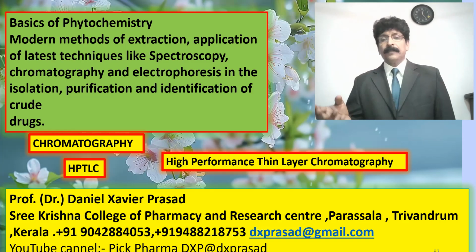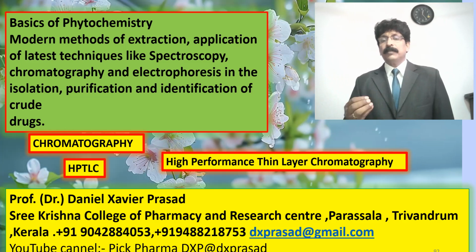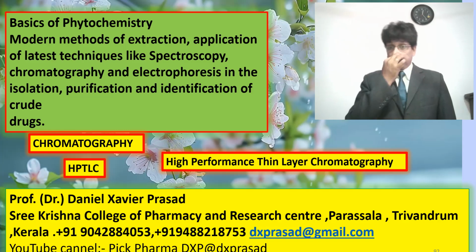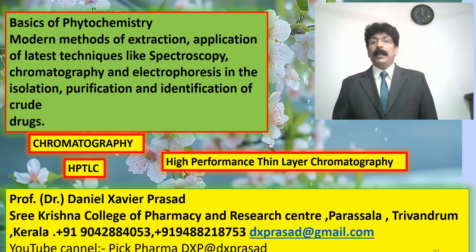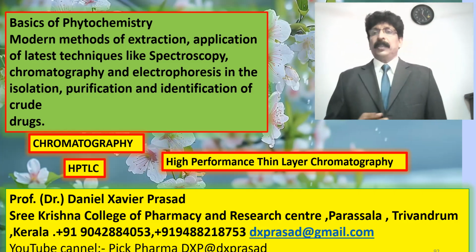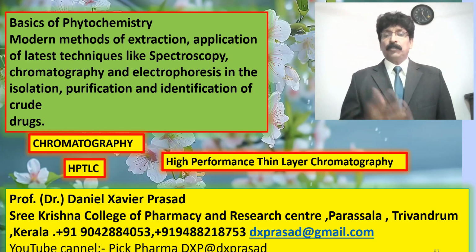as performance. Even in the way you are giving the solvent system, it is an interesting technique. Even pressure can be applied, giving some active movement of the mobile solvent, as we did in high performance liquid chromatography. That is also possible in high performance thin layer chromatography.